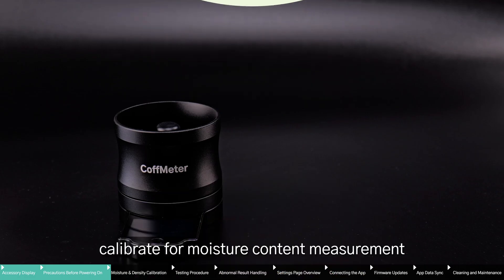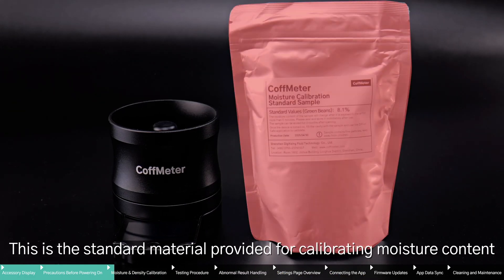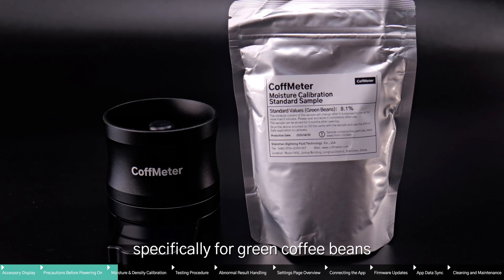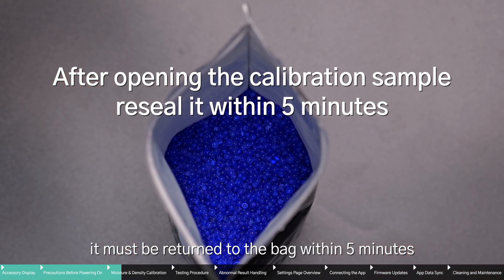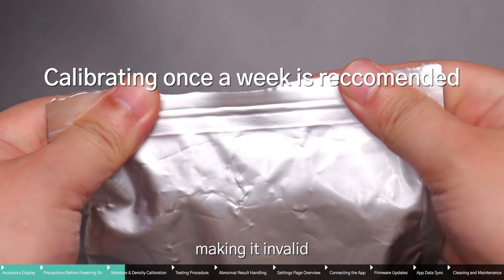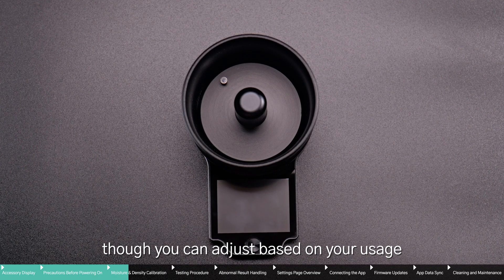Before testing, calibrate for moisture content measurement. This is the standard material provided for calibrating moisture content, specifically for green coffee beans. Once opened, it must be returned to the bag within five minutes, otherwise it may change color or deteriorate, making it invalid. It's recommended to calibrate once a week, though you can adjust based on your usage.